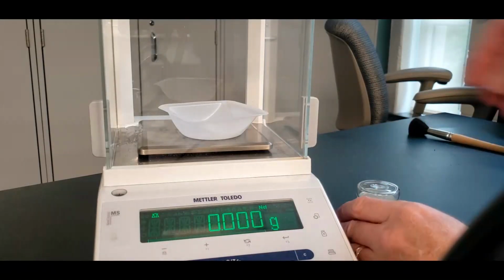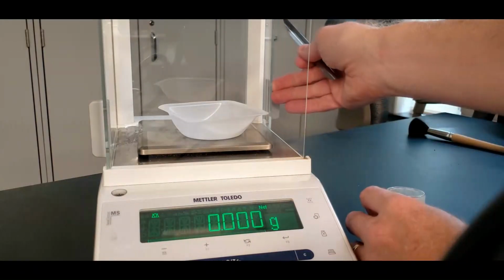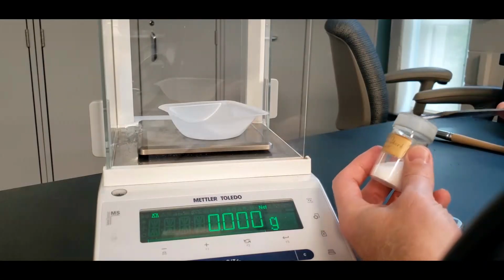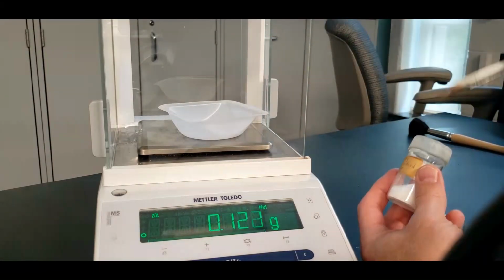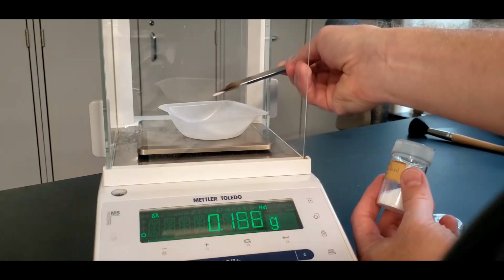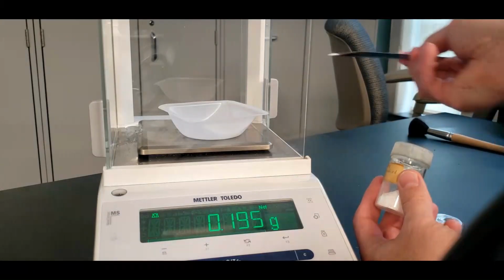Again, tricky here because I can't get around the camera very well. But what I'm going to do, use our spatula here and just put in enough to get around 0.4. It doesn't have to be exactly 0.4. Sometimes I forget to tell students that, and they're at the balance for about 10 minutes trying to get it exactly 0.4.